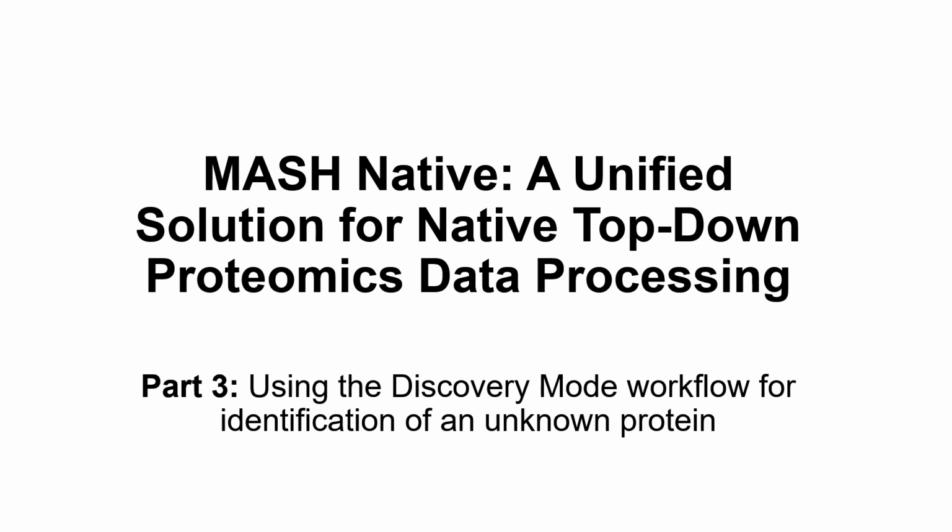MASH Native has the capability for analyzing both native and denatured mass spectrometry data and includes spectral deconvolution and database search tools. The Discovery Mode workflow is intended for analysis of an unknown protein or proteins. In this video tutorial, we will walk through Tutorial 1, Analysis of Mass Spectrometry Data Collected under Native Conditions for Identification of an Unknown Protein. Please pause this video and download the Native Discovery Mode tutorial folder to your computer and save it to a new local folder if you have not done so already.